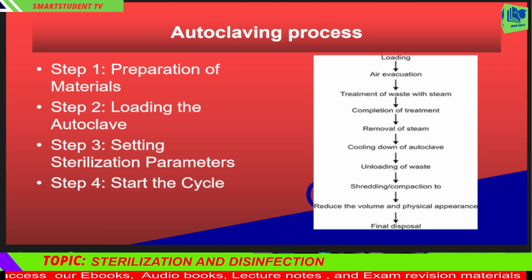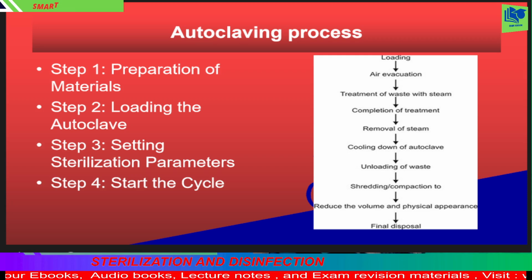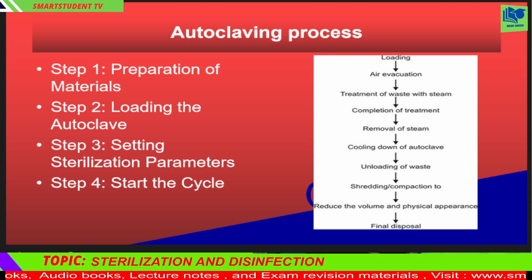Step 4. Start the cycle. Activate the autoclave cycle. Monitor temperature and pressure gauges. Wait until the cycle is complete and the pressure returns to normal.